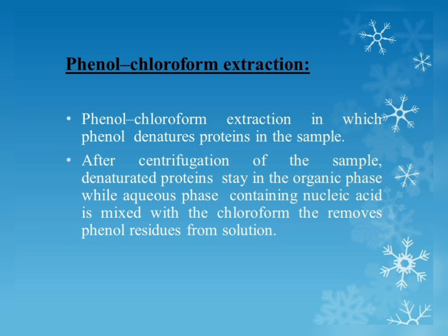In phenol chloroform extraction, phenol denatures proteins in the sample. After centrifugation of the sample, denatured proteins stay in the organic phase, while the aqueous phase contains the nucleic acid, which is mixed with chloroform that removes the phenol residues from the solution.